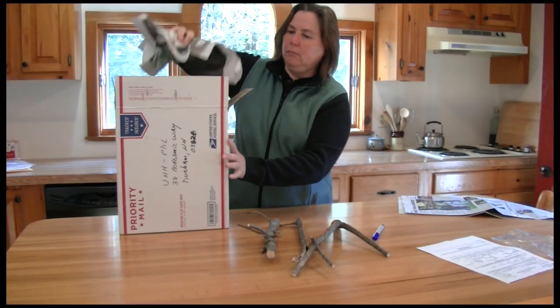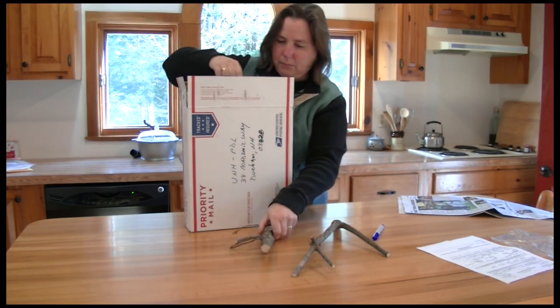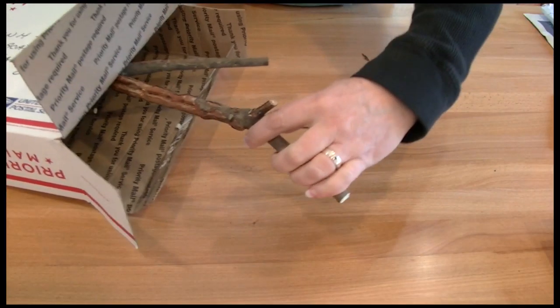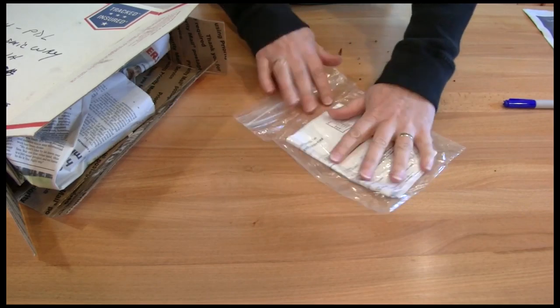Larger branch samples can be shipped in a box. It's best to add some padding of newspaper or bubble wrap to avoid the branches from shifting around in the box during shipping. Include the form and payment in a plastic bag and send to the Plant Diagnostic Lab.